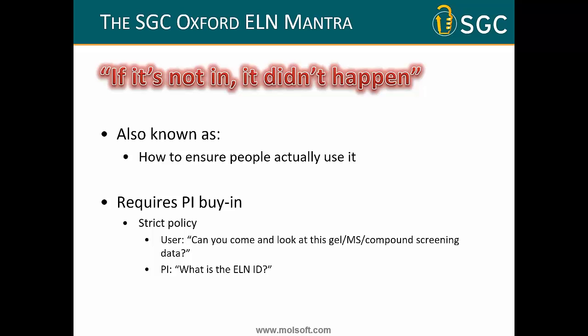So we developed this mantra at the SGC that goes like this: if it's not in, it didn't happen. So in other words, if someone does an experiment and they come to a PI, then in general PIs have been conditioned, as it were, over the years to say, well, is it in your ELN, is it in Scarab, is it in the LIMS system? And if it's not, they have to go away and write it up. And this is the gatekeeper, if you like, the sleeping policeman that makes sure that the stuff actually gets in.